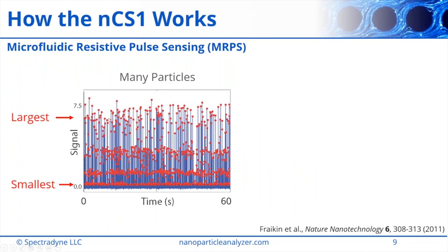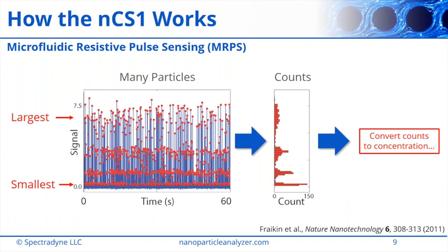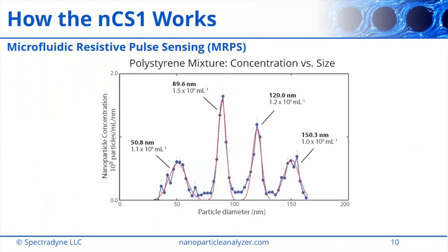And here we've highlighted all the particle events with red dots. You can see there are particles being measured at different sizes. And straight away from the histogram of the counts, we can see that there are 4 different populations of sizes in the sample. And now, because we know the volume of liquid that we've measured from measuring the transit time of the particles through the constriction, we take the number of counts divided by the volume, and that's the concentration very directly.